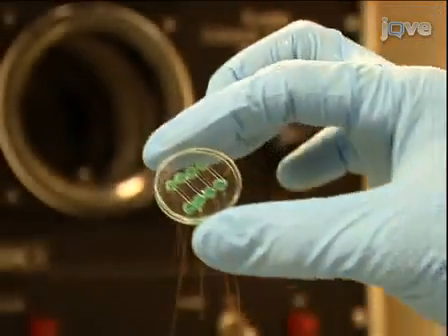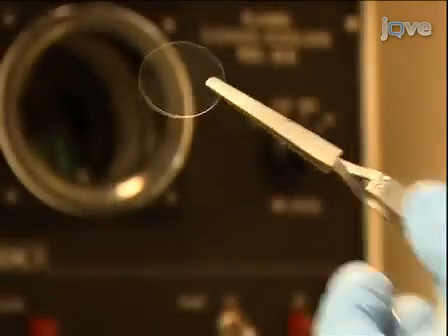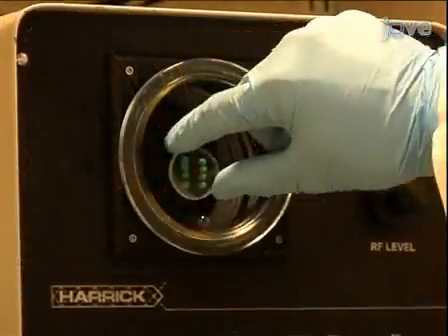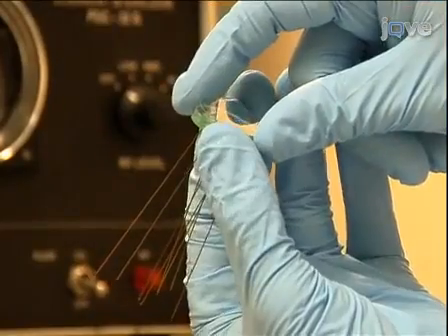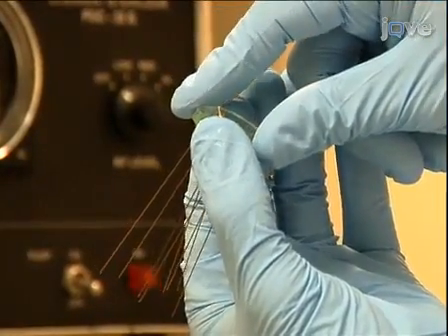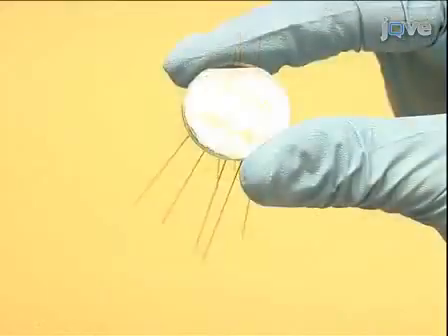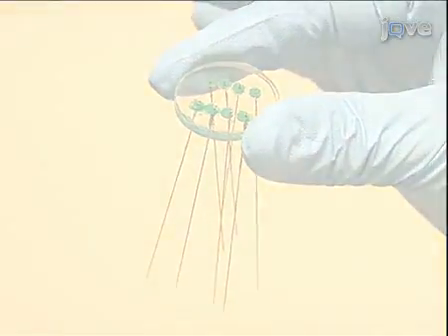After plasma activating the cell and a freshly piranha-cleaned 1-inch circular quartz cover slip for 30 seconds, fuse the cover slip to the side of the cell containing the channels. The chambers are now sealed. Leave the assembled cell curing overnight at room temperature.